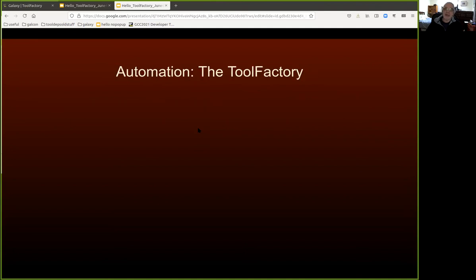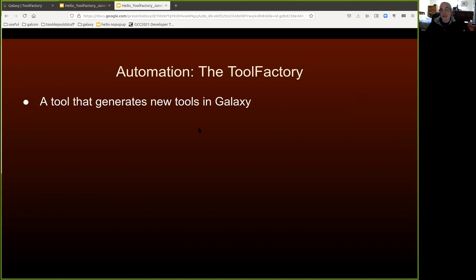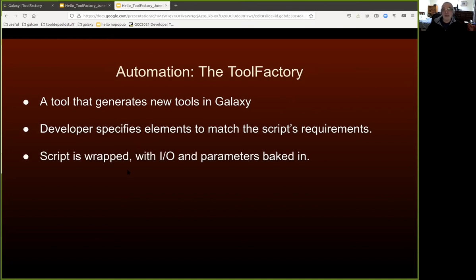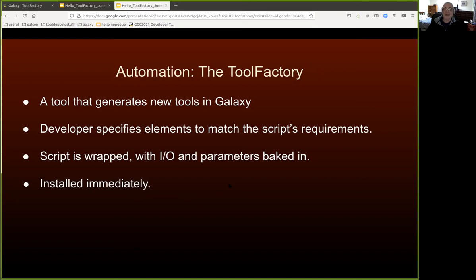That's the Tool Factory in a nutshell — admittedly a trivial example. But it does automate generating simple scripts, and can generate more complicated ones too. The Tool Factory is a tool that runs in Galaxy and generates new tools effectively inside Galaxy. The developer is responsible for specifying all the elements that match the script being wrapped. When you press execute, the Tool Factory generates new XML with all IO and parameters, and it's immediately installed.